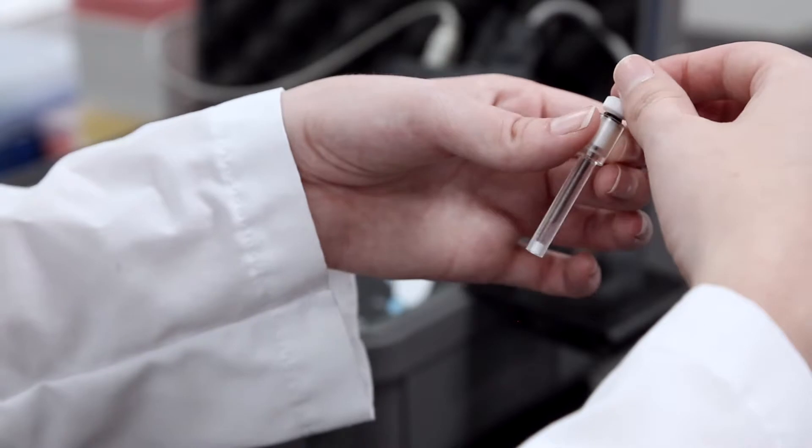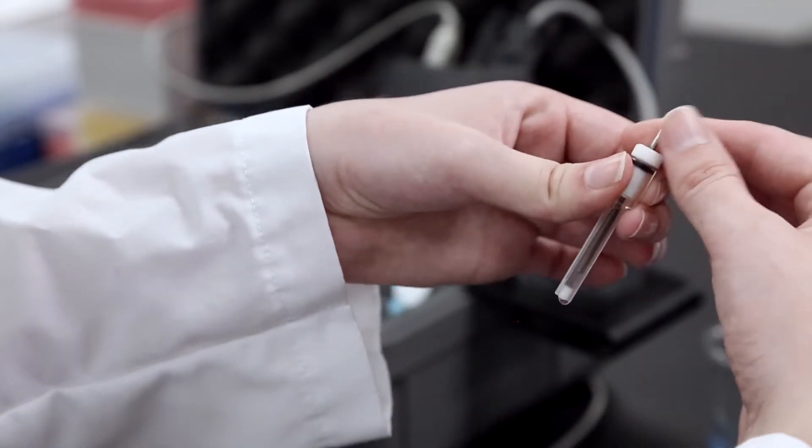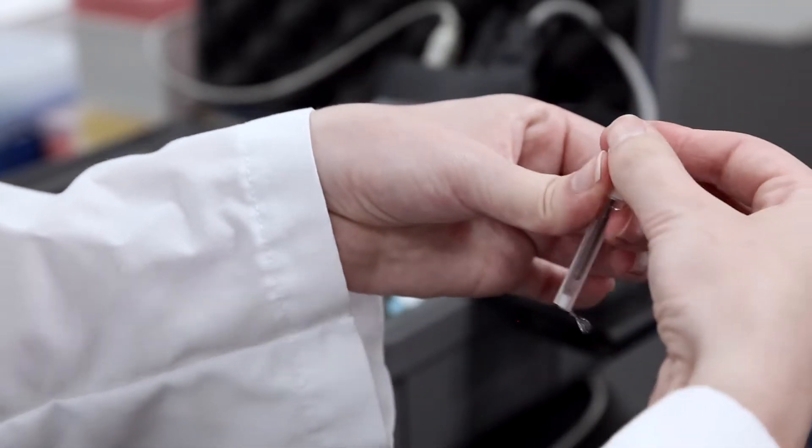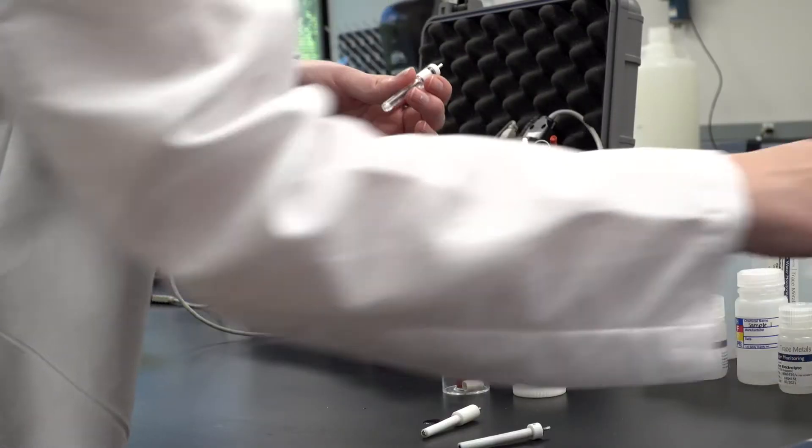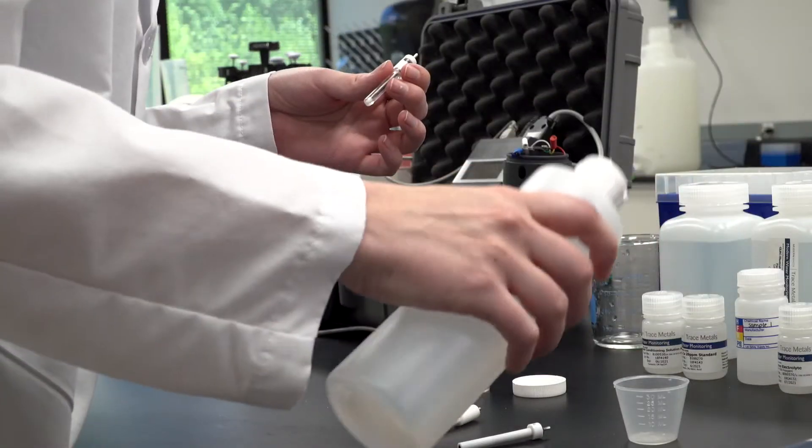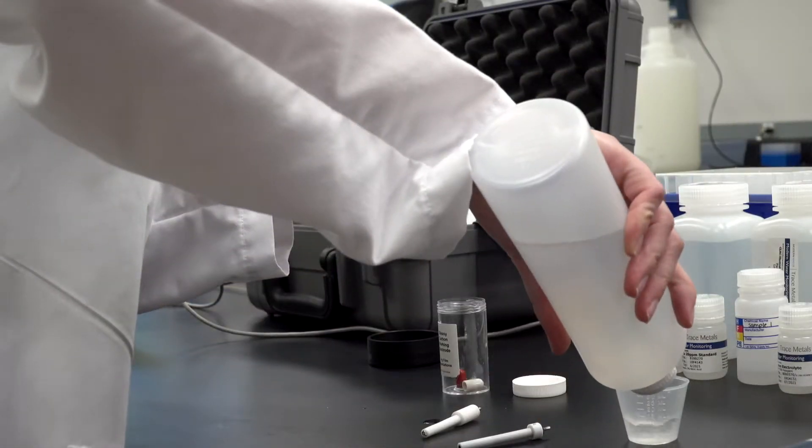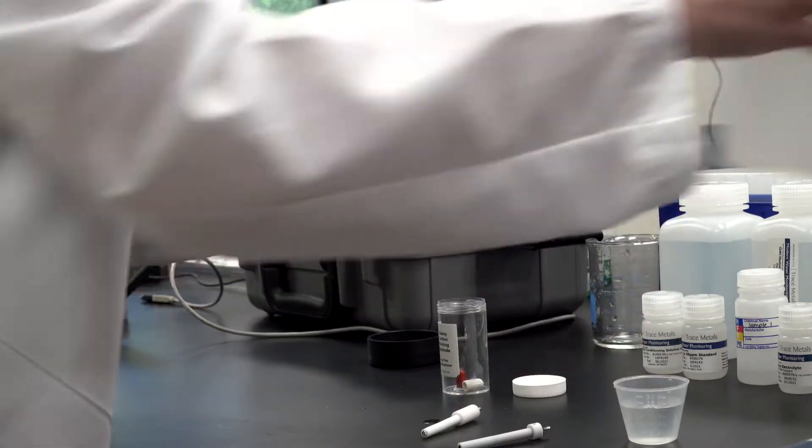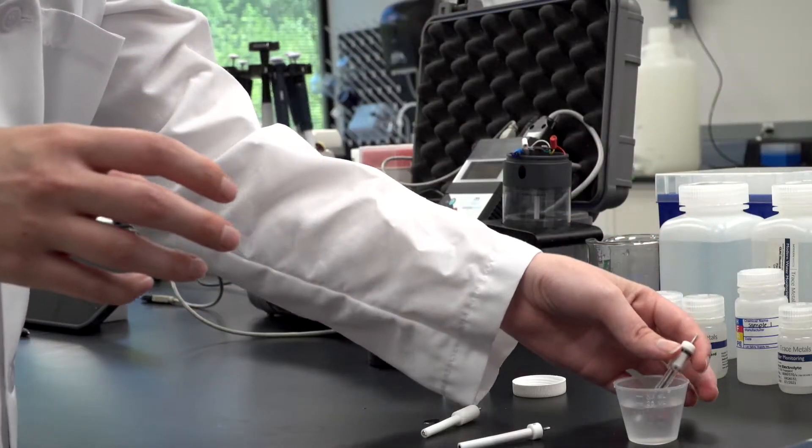Keeping both parts upright, insert the electrode into the electrode sleeve. Use a twisting motion to get the O-ring into the electrode sleeve. You should see a small amount of liquid come out through the white frit at the end. Store upright in the analysis cell or a cup of deionized water.